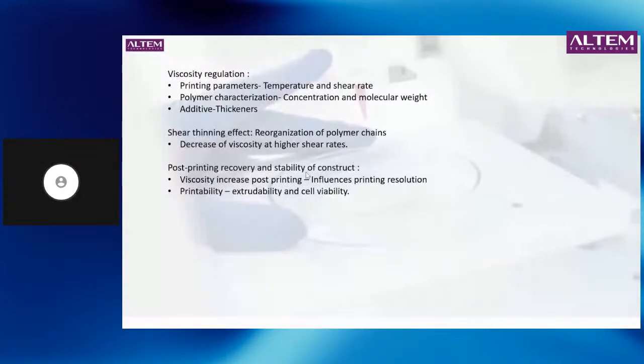So there is influence. Yeah. So the amount of viscosity will definitely impact the printing resolution. Then comes the printability, that is extrudability or cell viability. Extrudability basically is how the pressure impacts the material and how it is coming out of the nozzle head, and how well it is giving me the structure I want to create.